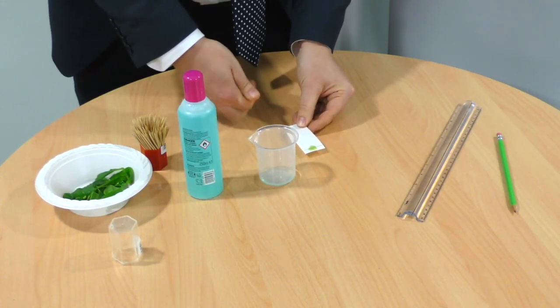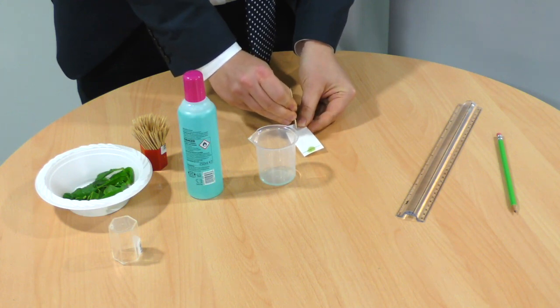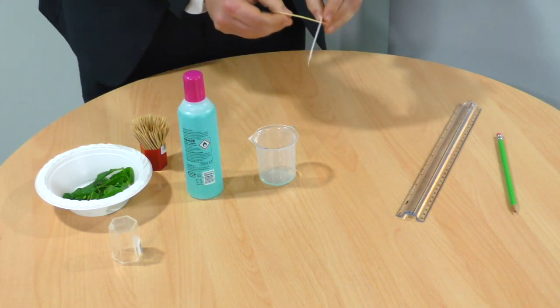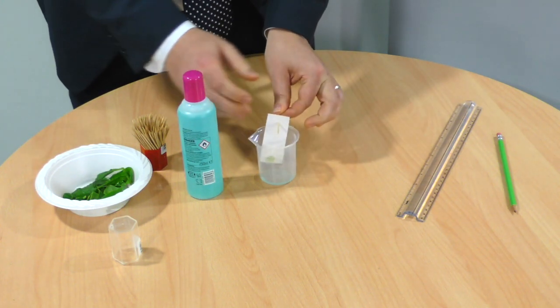Pierce the paper with the cocktail stick — I'm using some blue tack here to avoid injuring myself. Push the cocktail stick all the way through the paper and then suspend the paper over the beaker.